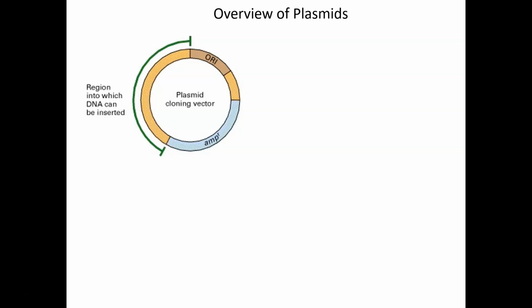Those are the bacteria that we want. Other bacteria will not successfully absorb the plasmid. That's a failed process. We don't want those bacteria. So we can expose bacteria to our plasmid and then grow that bacteria on ampicillin. All of the bacteria that receive this plasmid have the ampicillin-resistant gene.